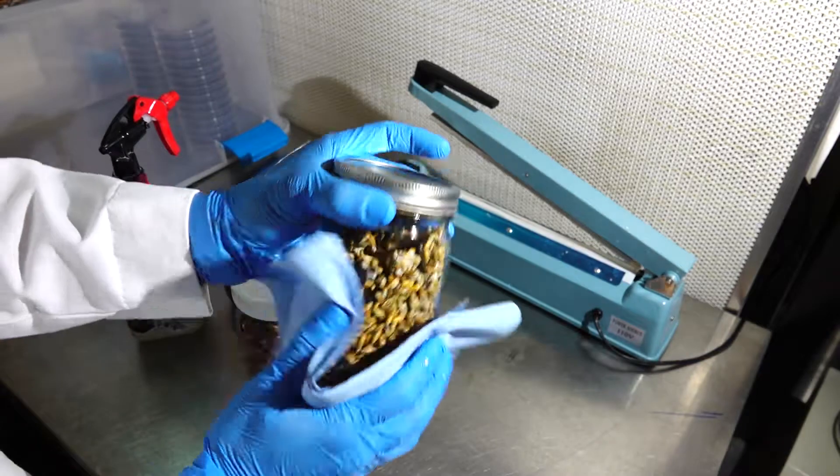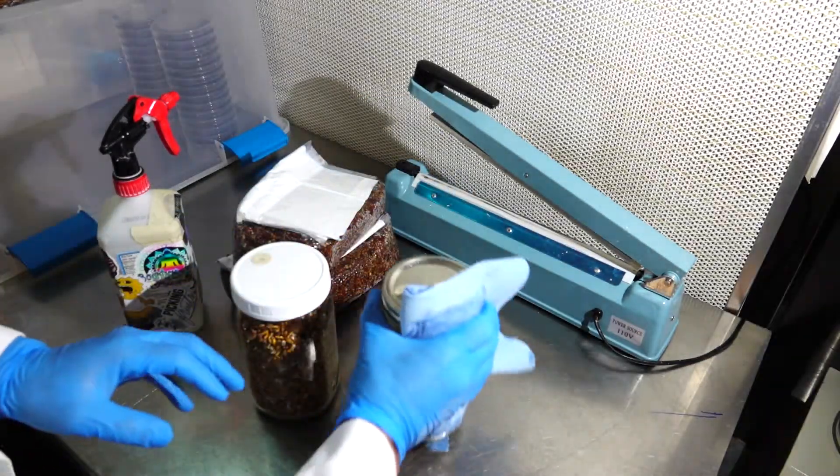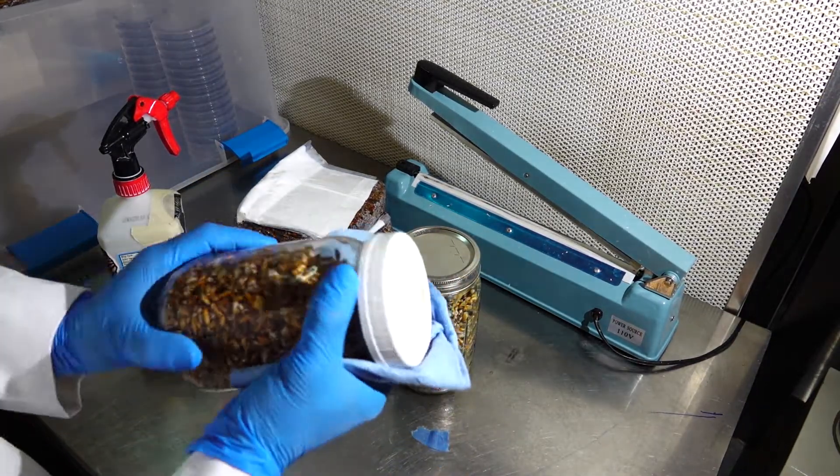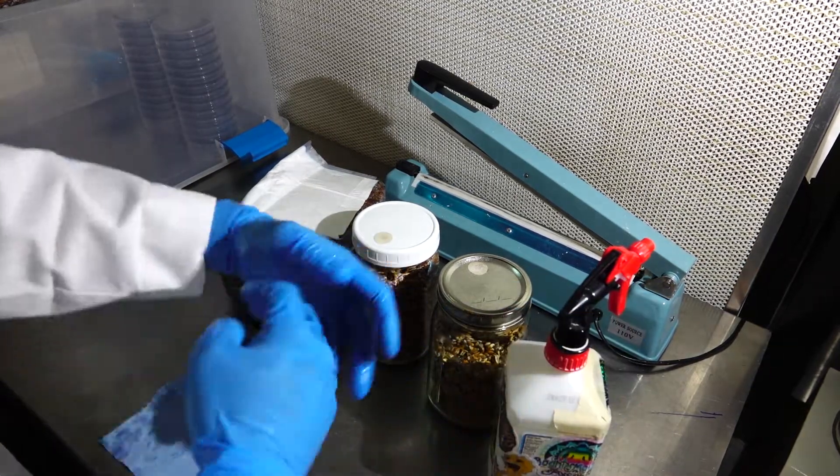The next step of the process is going to be wiping down your jars with isopropyl alcohol. You want to make sure that they are as sanitized as they possibly can be so that you don't introduce any bacteria from outside of the jar into your freshly sterilized grains.